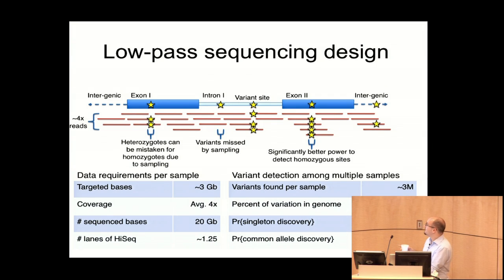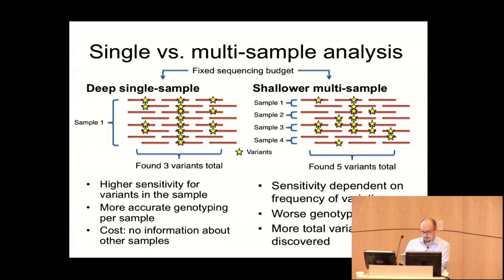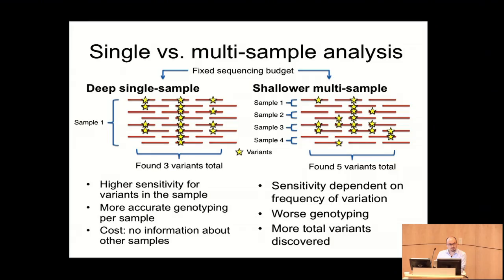There's also, however... I have a question about that. Mm-hmm. This 1,000 Genomes Project is being used by a lot of people to establish normals. Yeah. And what you just said makes me a little worried about that. Sure. So how do you reconcile those? It's the normals that become, if you're in the rare variant business, real-ish. Yes. And so the 1,000 Genomes Project is looked upon by most of us as at least a partial solution to that. Right. So how do you reconcile it?